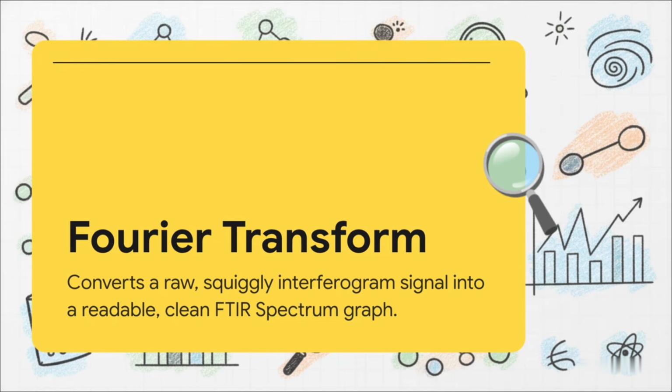And this is exactly where the Fourier transform part of the name comes in. Fourier transform is essentially a complex mathematical process that acts as a translator. It takes that raw, messy interferogram and magically converts it into a clean, highly readable FTIR spectrum graph. On this graph, we track wave number along the bottom axis and transmittance up the side, which lets us read the specific peaks and valleys that make up our chemical fingerprint.